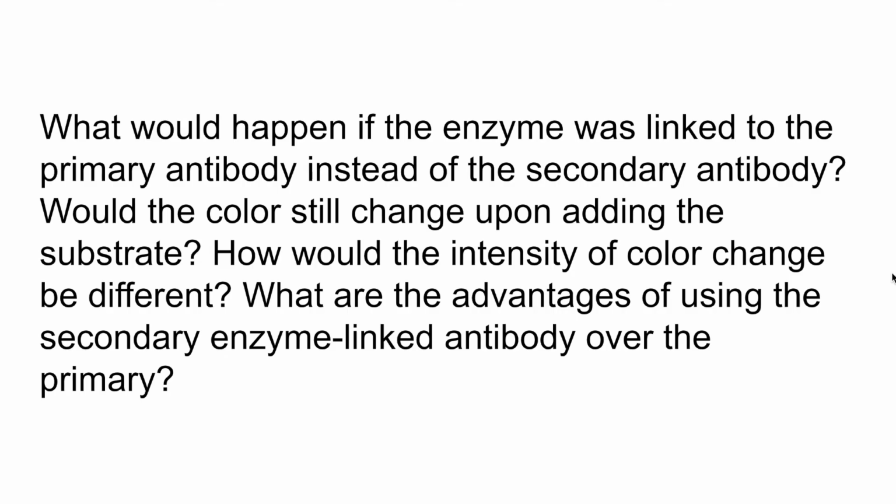Now, what would happen if the enzyme was linked to the primary antibody instead of the secondary antibody? Would the color still change upon adding the substrate? How would the intensity of color change be different? What are the advantages of using a secondary enzyme-linked antibody over a primary linked?